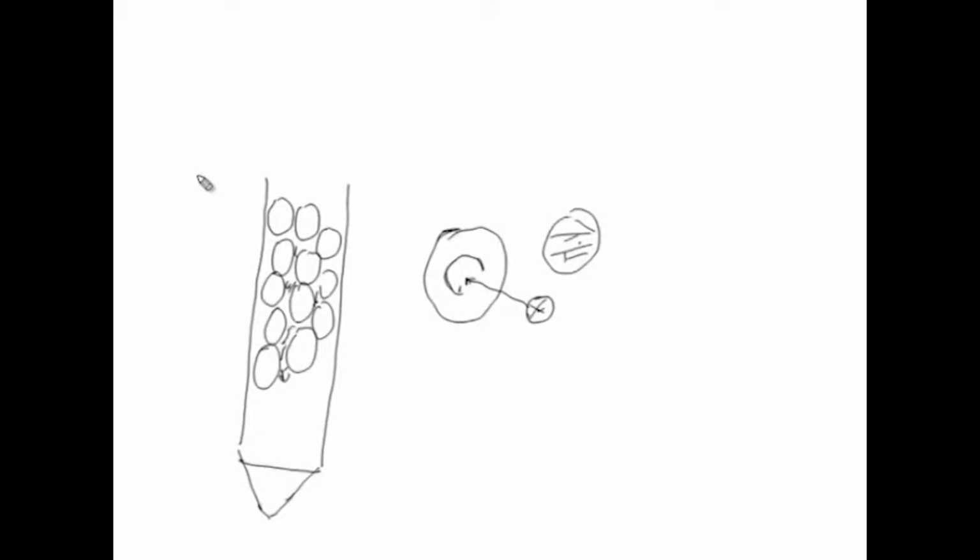So, this will come very fast, but the smaller molecule will spend more time, because it will go back and forth as it travels down the column. It will move back and forth into the stationary phase and then the mobile phase. So, if you compare different sizes of molecules, there is one size, another size, another size, and a larger size. All of these molecules, according to their molecular mass or molecular weight, will spend relatively different times: the smaller the longest time, the largest the least time, and in between they will spend different times as per their size.